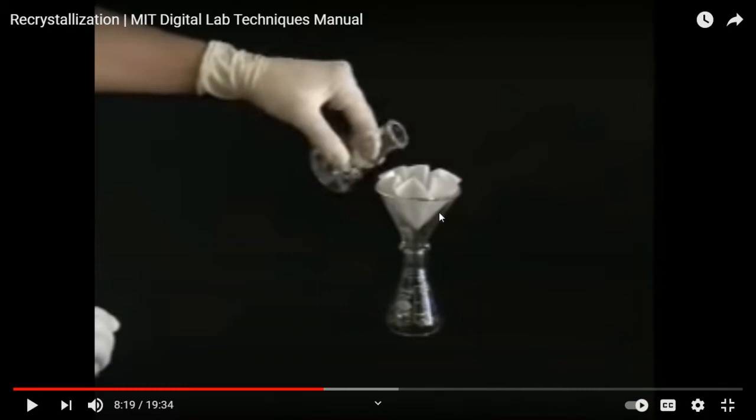Then you are gonna have some crystallization of your compound which will be filtered off. That's a disaster. We want your compound to go through the filter paper without color. So the bottom here is supposed to be your compound and the pure solvent. That will be subject to the next stage, the cooling stage, the recrystallization stage. We don't want any crystal filtered off by cooling off, by delaying filtering, right?